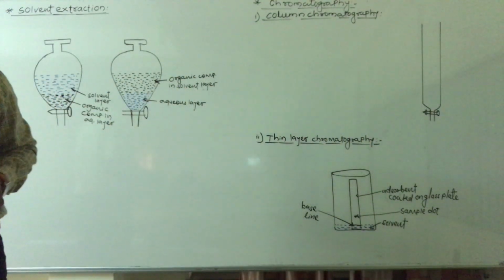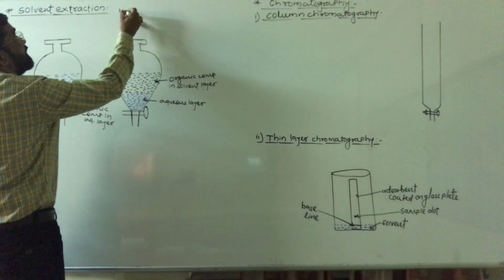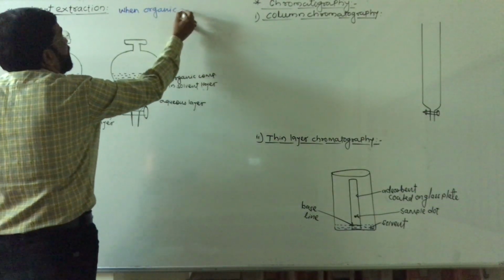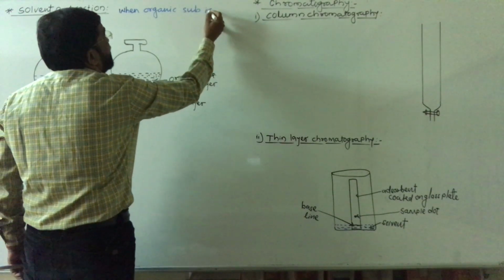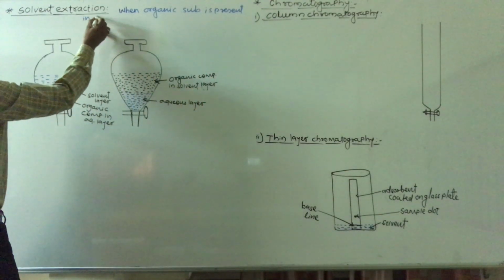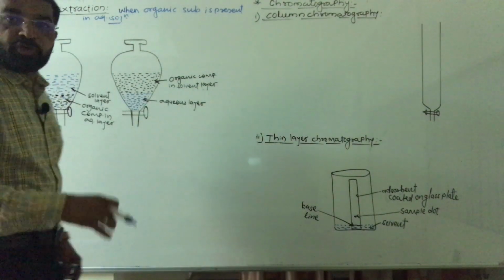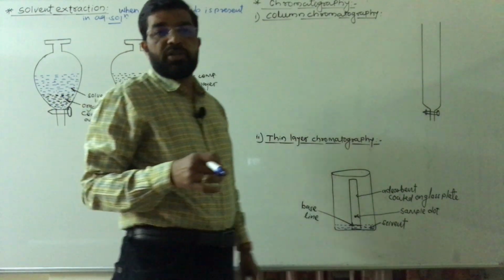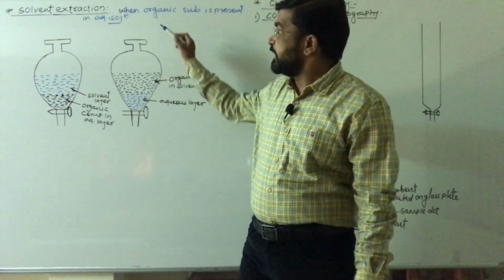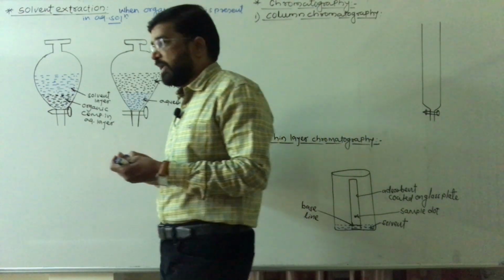In this solvent extraction, when an organic substance, an organic compound, is present in aqueous solution, then for the separation of that organic substance from that solution, the technique used is solvent extraction.